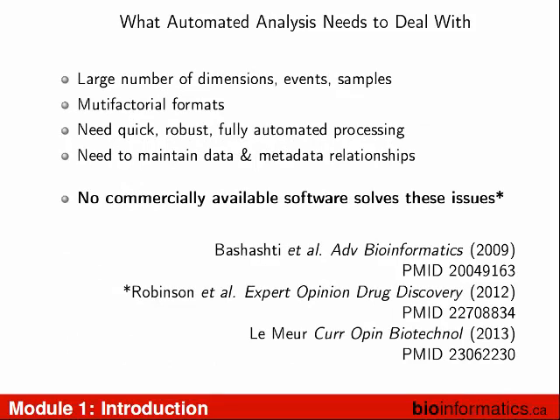So if we're going to use automated tools to do the analysis, what do we have to deal with? Well, there's a large number of events, dimensions, and samples. So the algorithms, you don't want to wait around for a computer. That's just frustrating, right? We get so upset when, oh my God, I have to get the latest iPhone because it takes an extra 30 seconds to load the web page. We're used to having immediate gratification. So the algorithms have to be quick and fast so you're able to handle it. We can farm out to large nodes, but we want to be efficient.